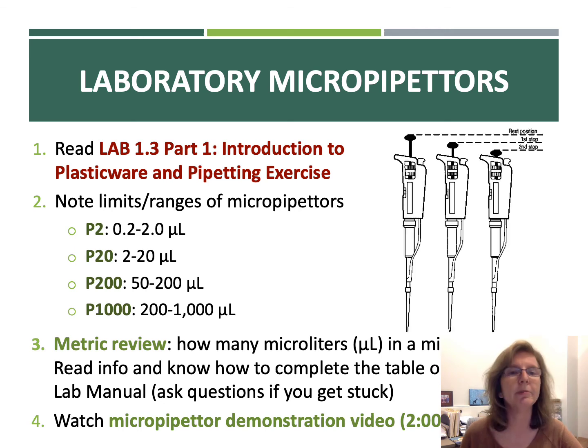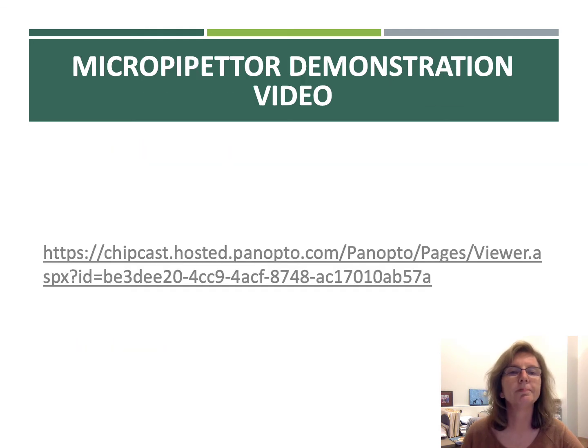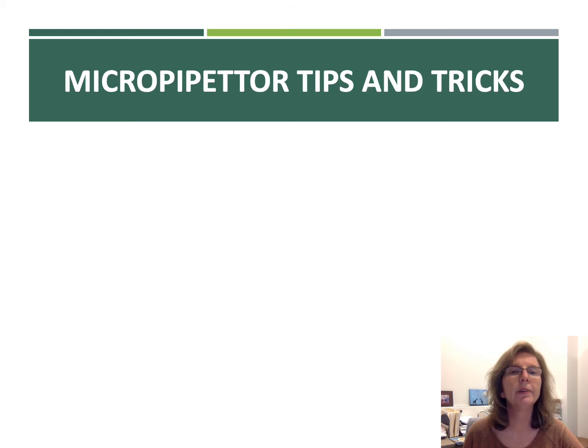Okay, and there's our little images of those different pipetters. So that's reminding us that there's 3 positions of the plunger, the rest position, the first stop, and then that second stop. And hopefully that looks familiar. But the video, again, will help a lot. So there is the link, so please watch that before you come to the lab.